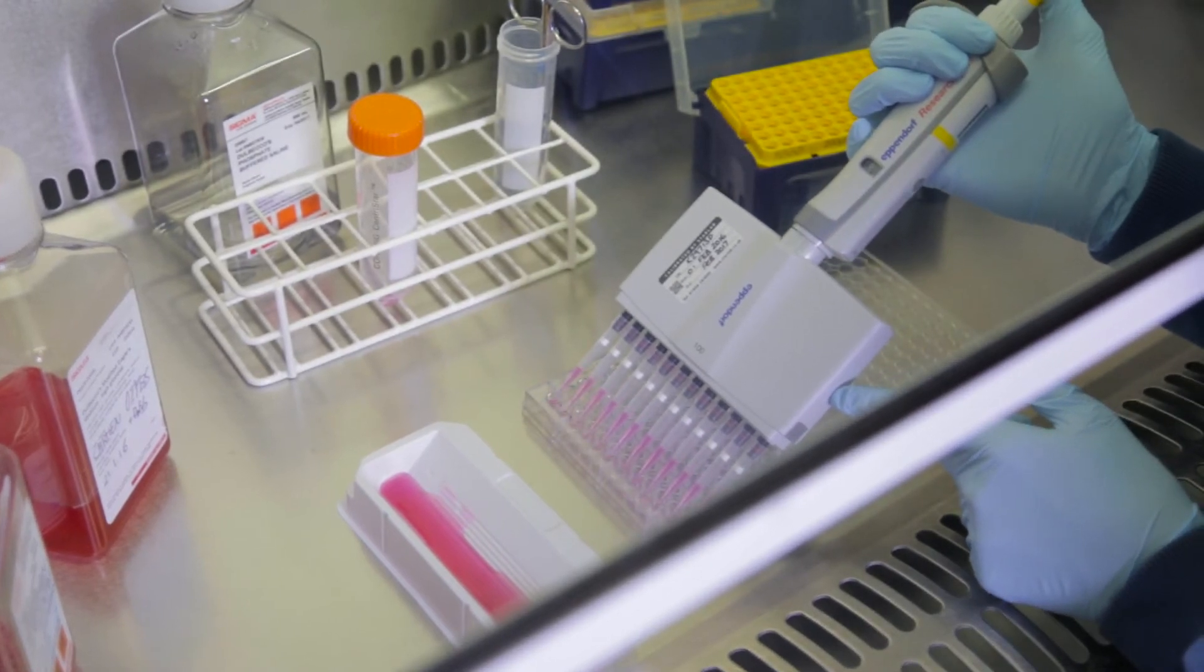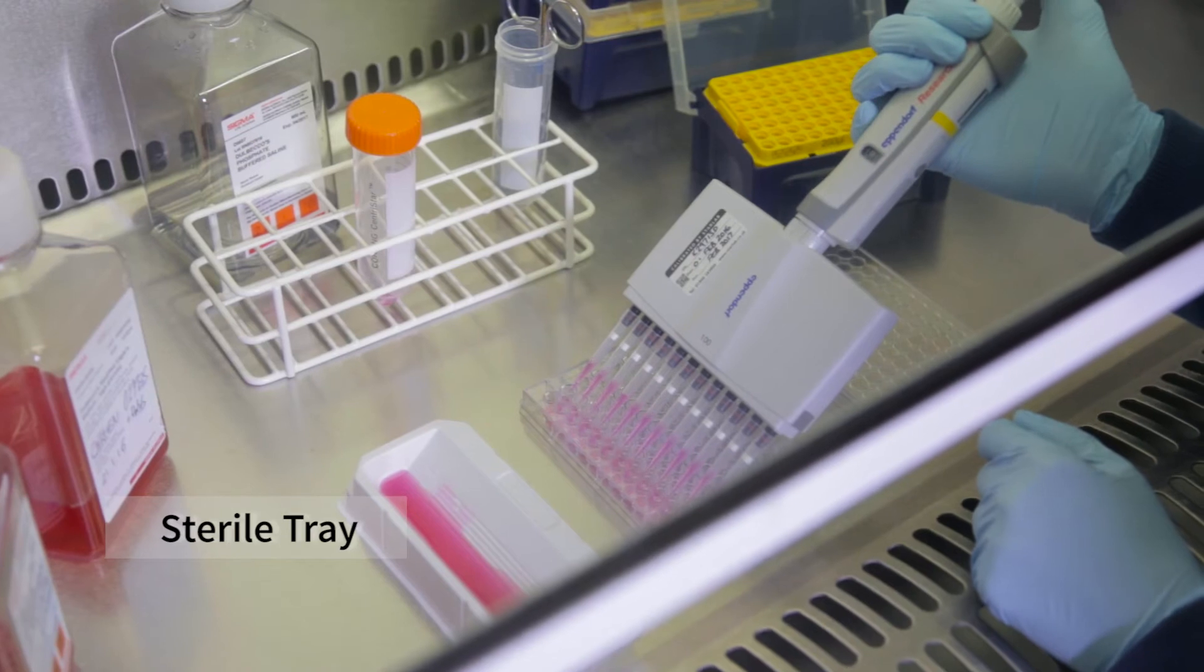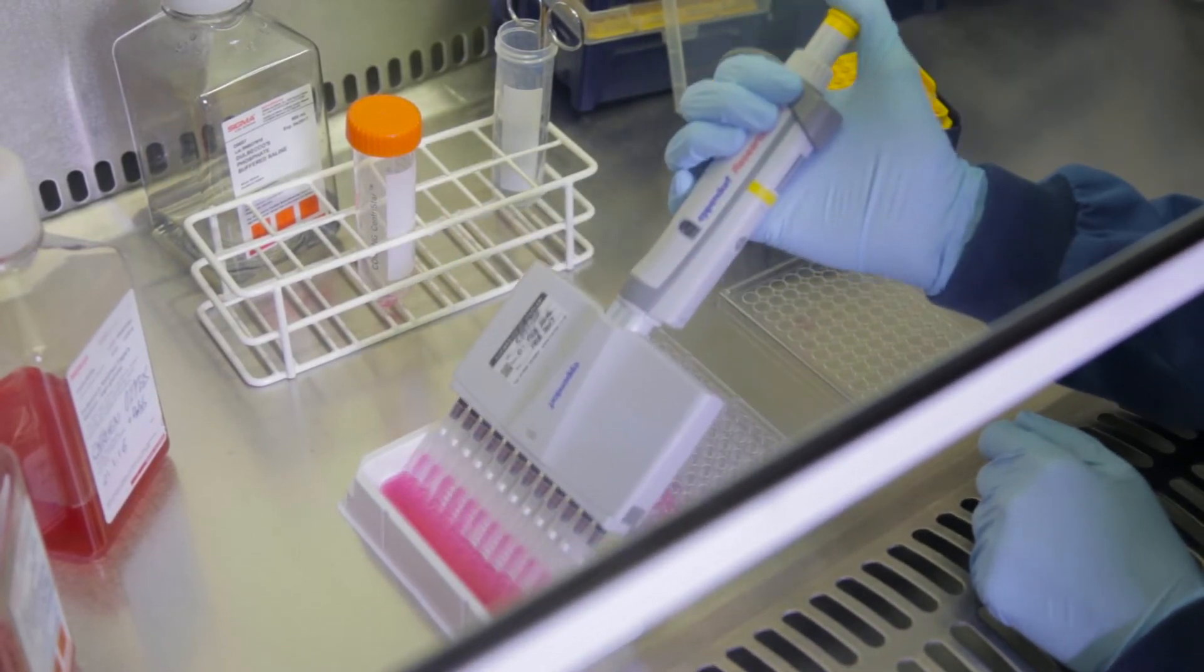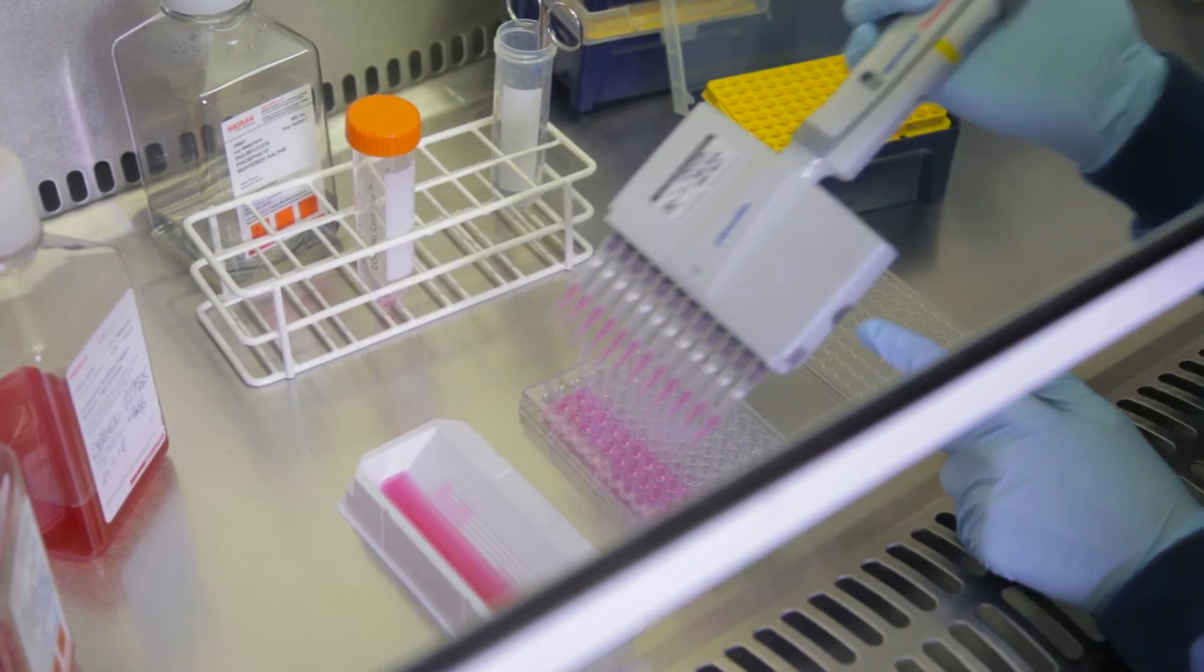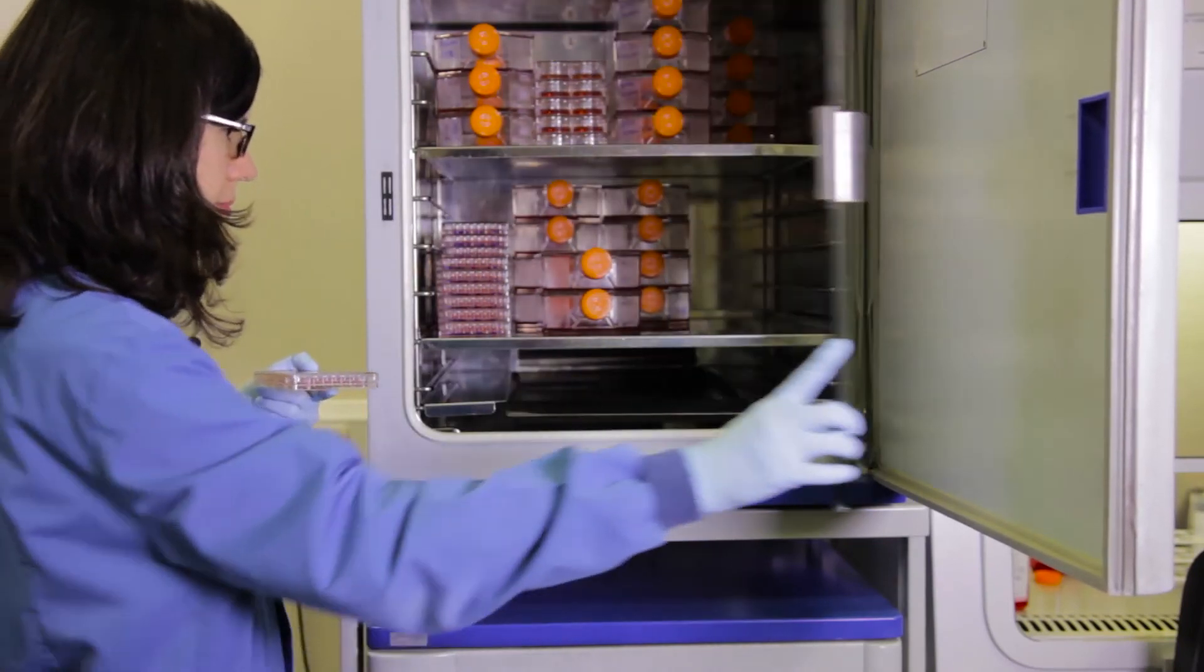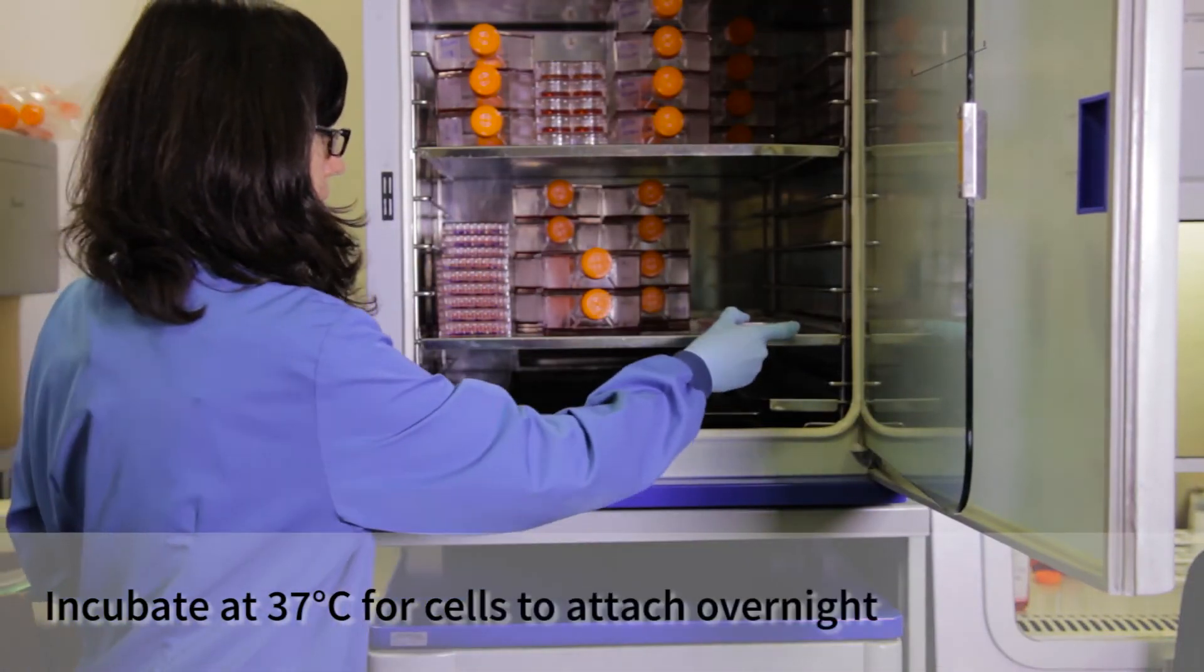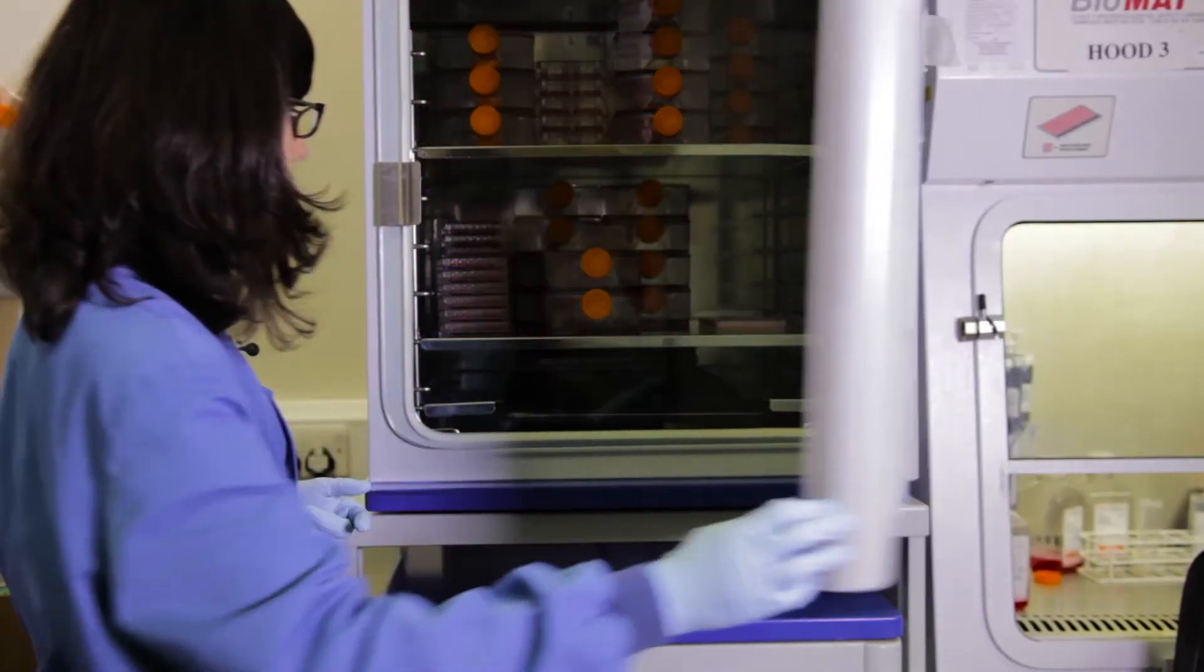Now, I am going to use a multi-channel pipette to add the same volume of cells to all wells, in this case 100 microliters. First, I have put the diluted cell solution in this sterile tray which makes it easier to pipette. Then, I attach the tips to the pipette and carefully pipette the cells into the plate, row by row. Now, I put the plates in the incubator at 37 degrees. The cells will attach overnight and can be treated in my experiment tomorrow.